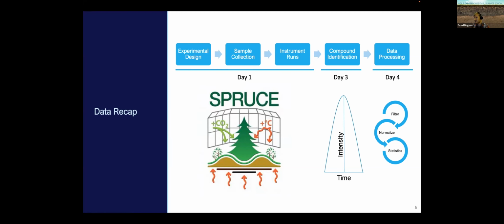And then we'll get into statistics, specifically differential abundance statistics, where we're comparing 2 groups at a time and seeing which of those peaks with those molecular assignments are either up or down expressed, which should sound very similar if you've done a lot of metatranscriptomics work or any of the other omics, lipidomics, metabolomics.